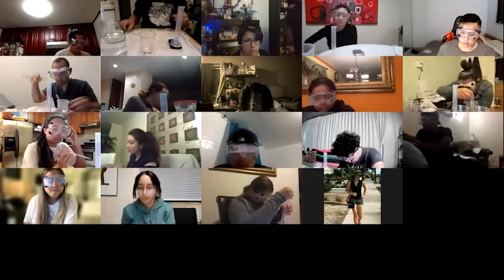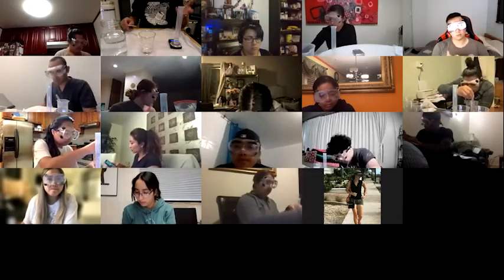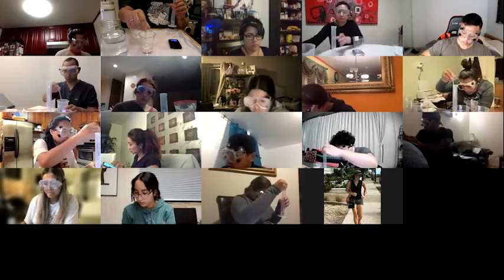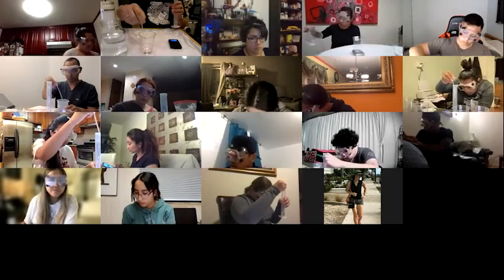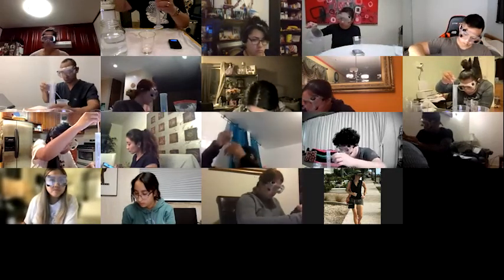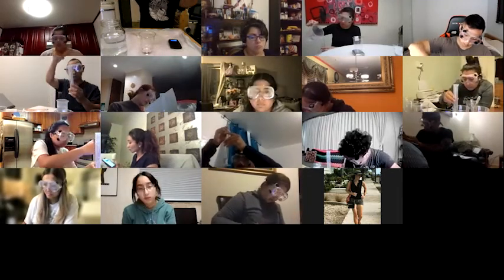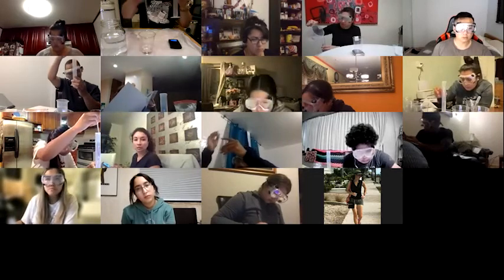And then I just keep going. So now I've got 10, then I'm going to do 15, 20, 25. Then I am finished. So once I've done that, then we will go over how to plot the data, because that is super important. Any questions so far?